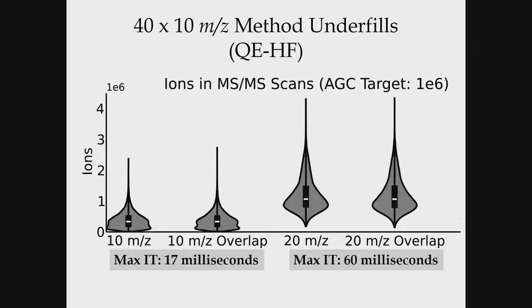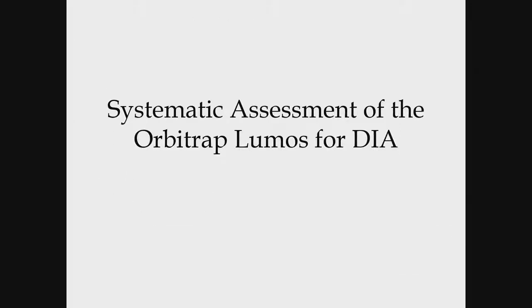No, so we'll talk about this a lot on Thursday. This is a little bit too early, but we actually overlap them by 50%, and we'll talk about the reason why we do that on Thursday. I had this figure from a previous talk, but I'm not going to get to that until Thursday. Yeah, we actually overlap them by 50%, and we do a deconvolution step in there.